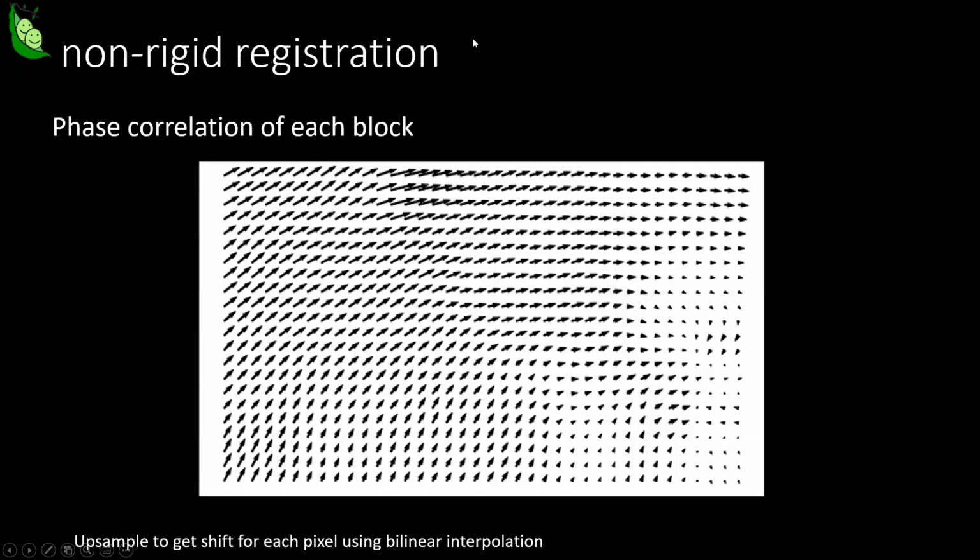And we only do that for the non-rigid because that's when we're actually shifting all these pixels. So the rigid is very fast, and then for the non-rigid we have to do this whole interpolation, and it's a bit slower, but we've sped it up by implementing all of this in Numba.